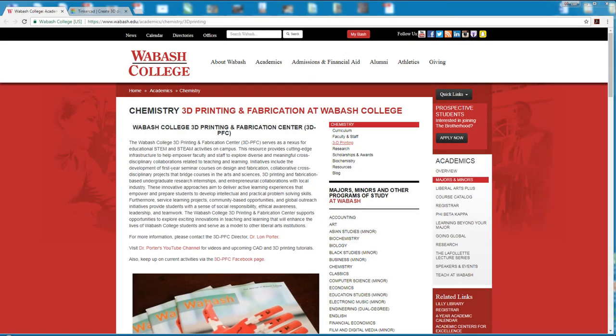Alright, so analytical chemistry students, you're going to start on a project this week where you're going to design your own 3D printed instrument, which I think is a pretty cool thing. Dr. Schmidt has given you a tutorial in page format, but seeing somebody do a demonstration on a software package is very helpful. Computer design is just so easy and powerful for designing customized equipment, and it's only going to become more important as 3D printing becomes more readily available.